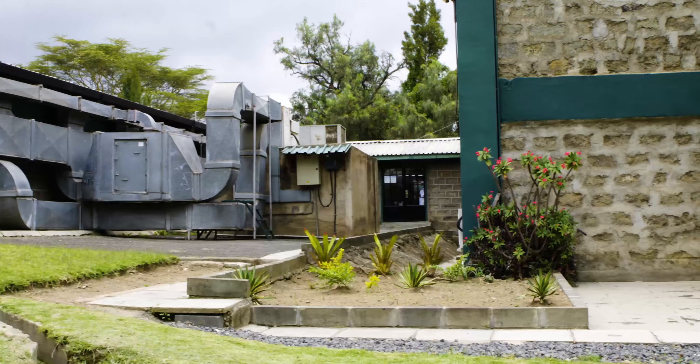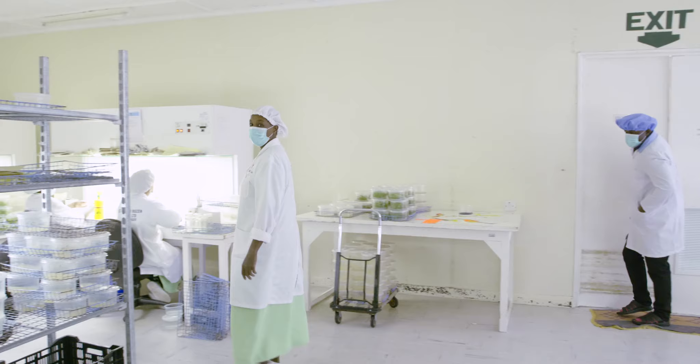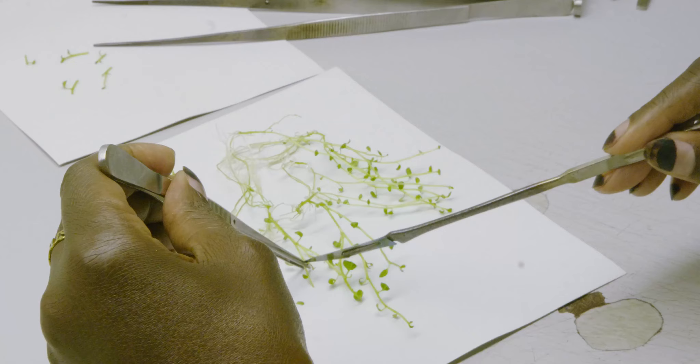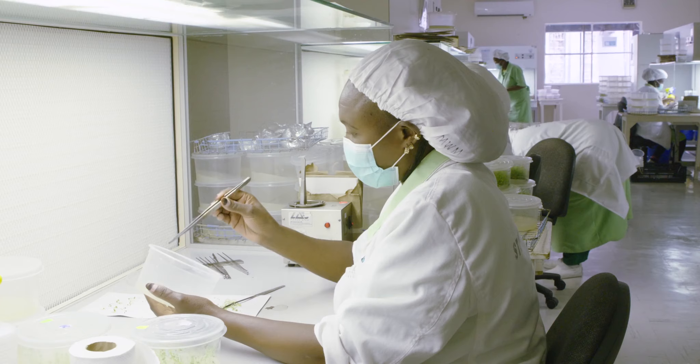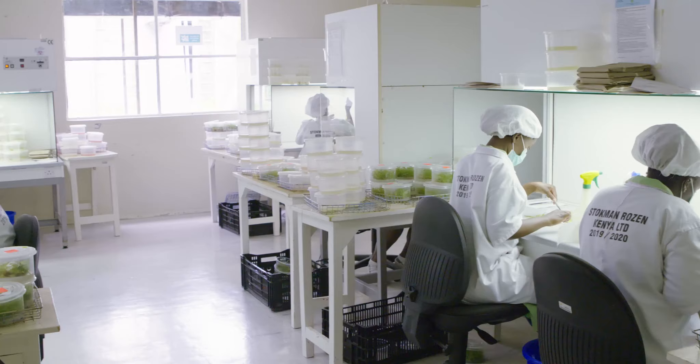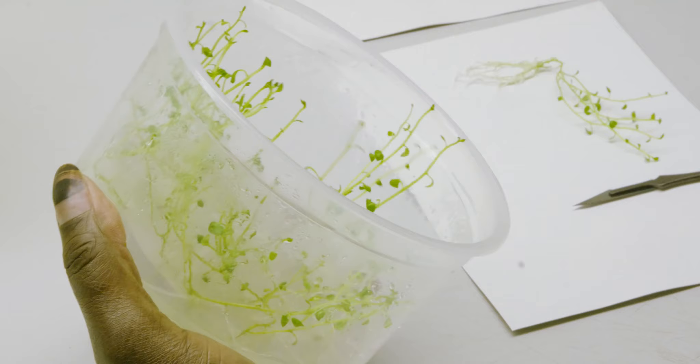Let us take a closer look at the stages of rooted apical cuttings production. The production begins in the tissue culture lab, where in vitro plantlets are multiplied through meristem cultures, a process that helps to eliminate viruses and other pathogens. This step is critical to guarantee disease-free starter material.